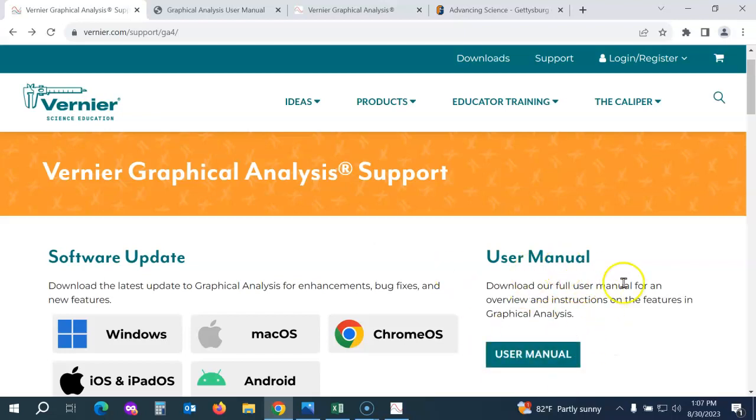You'll also see a link to a user manual here, so if there's additional functionality that you'd like to learn about, you can check out the user manual.